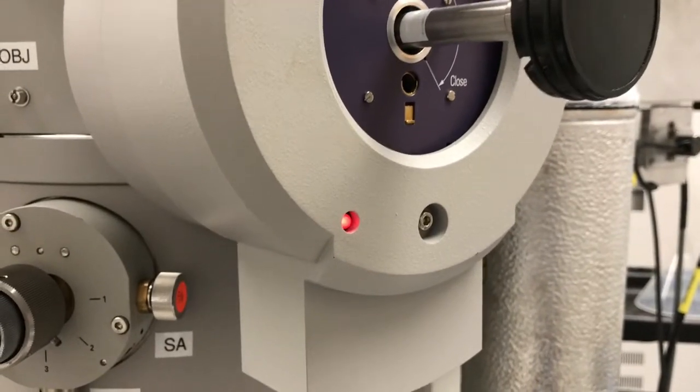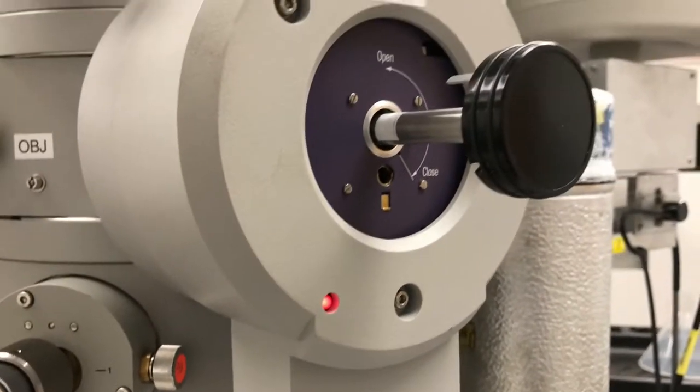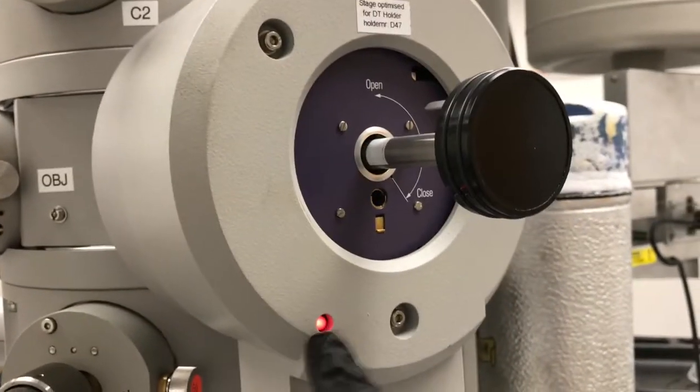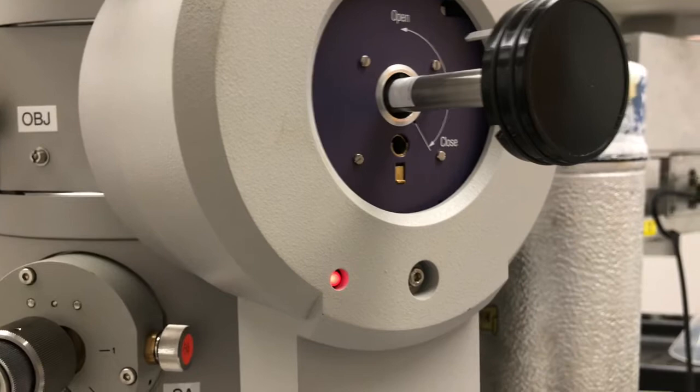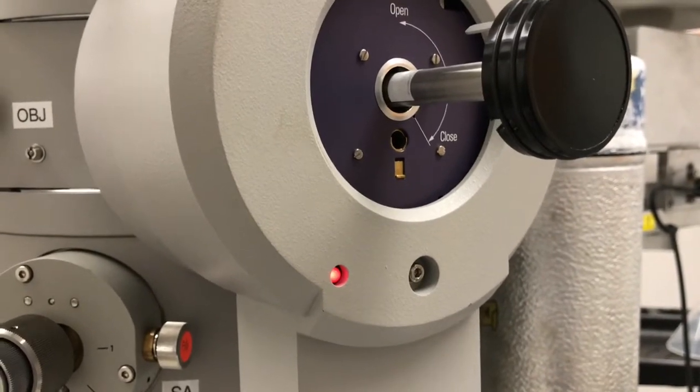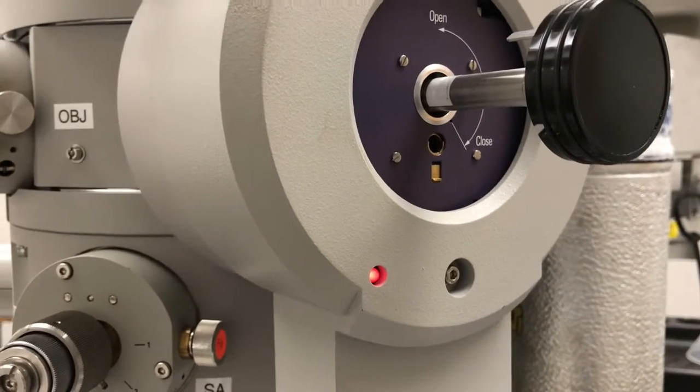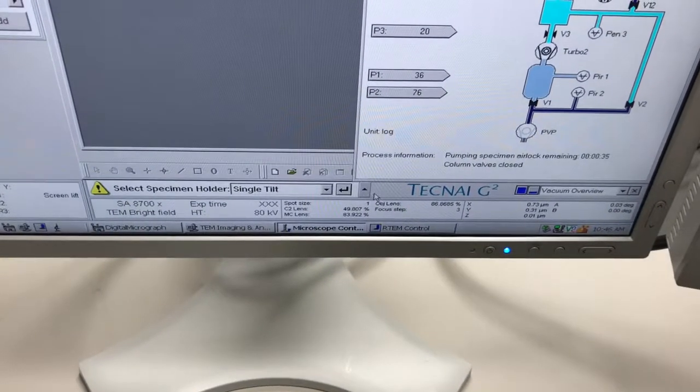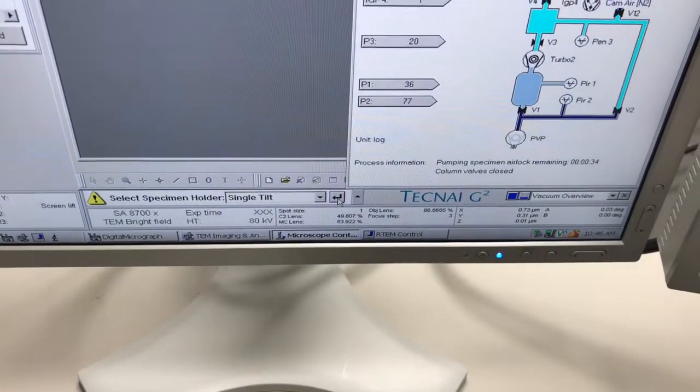That means the airlock's now being evacuated. This light also comes on. Red means stop, that means that the system is either evacuating or it's waiting for some information. It is of course waiting for us to tell it down here in microscope control that we have a single tilt holder, which we do.